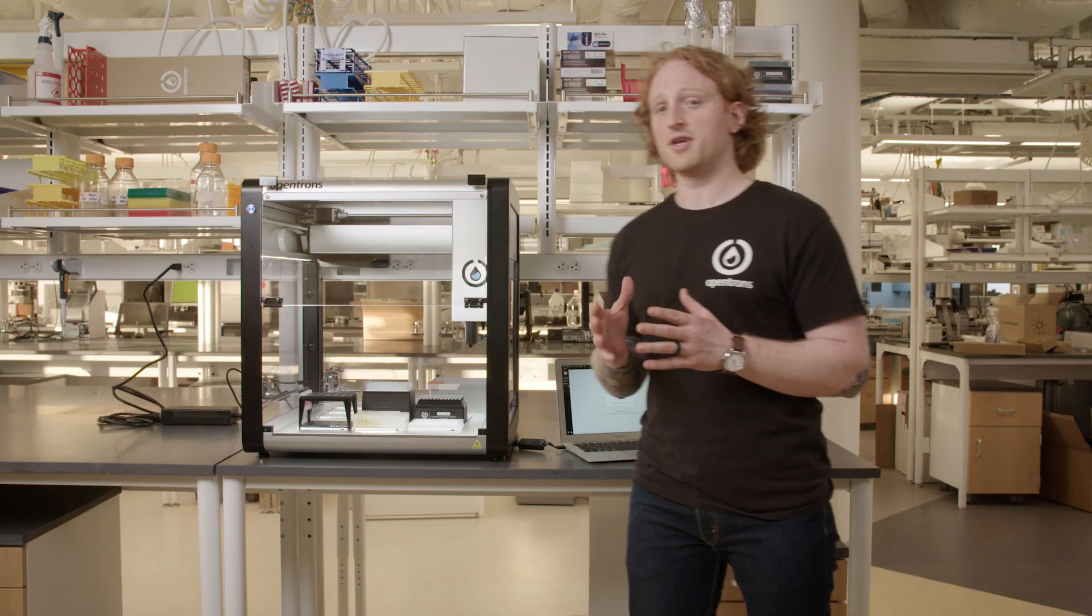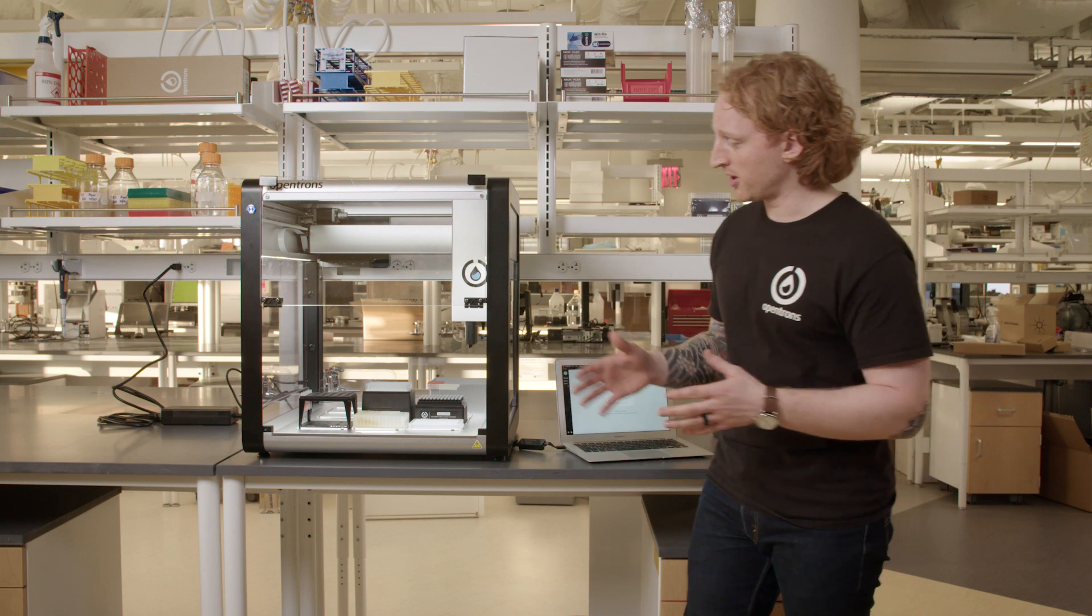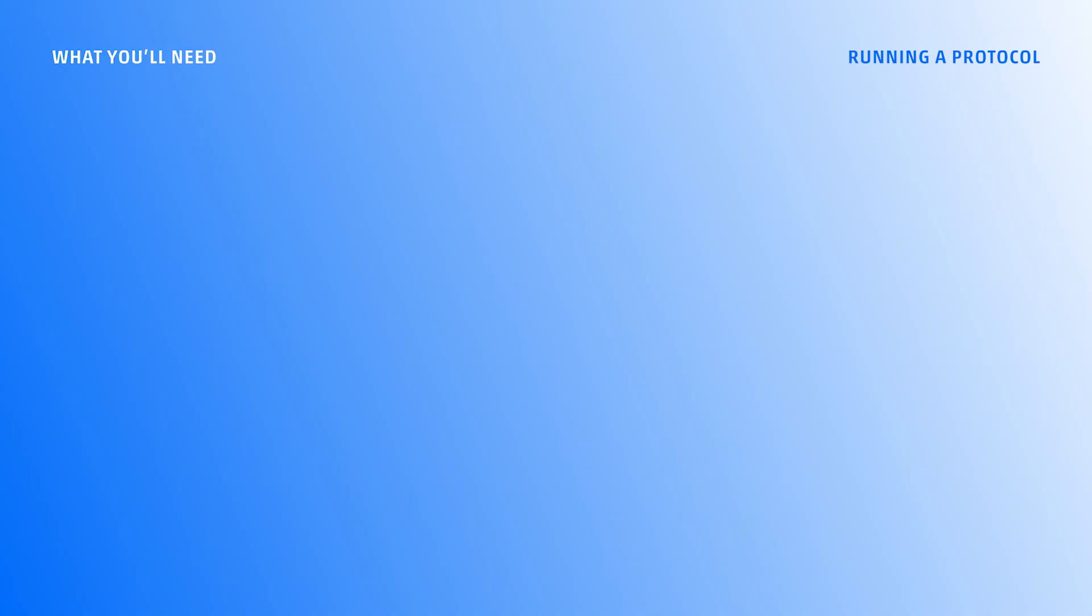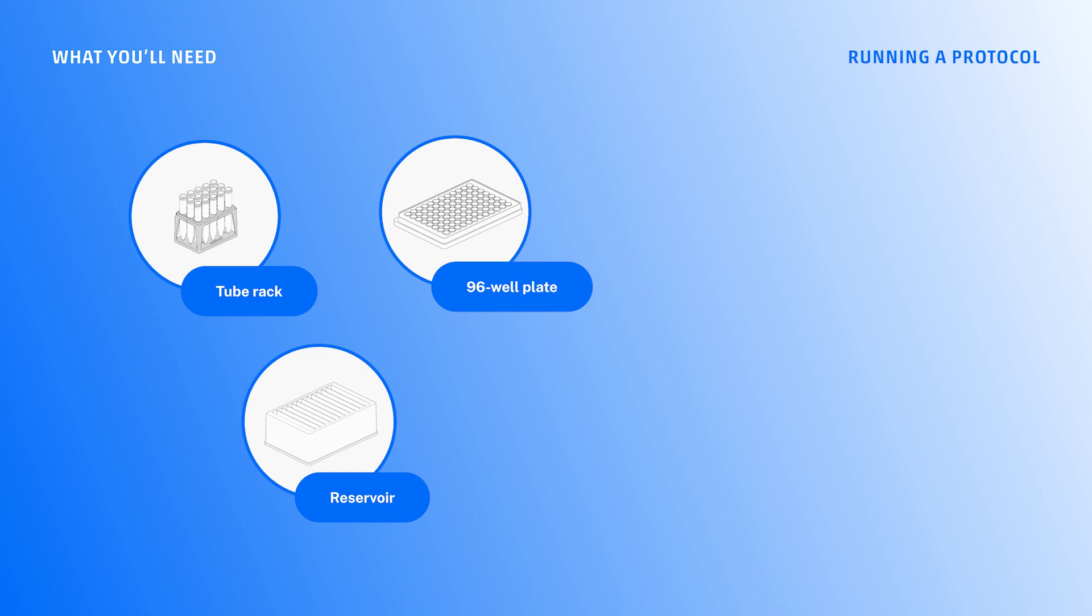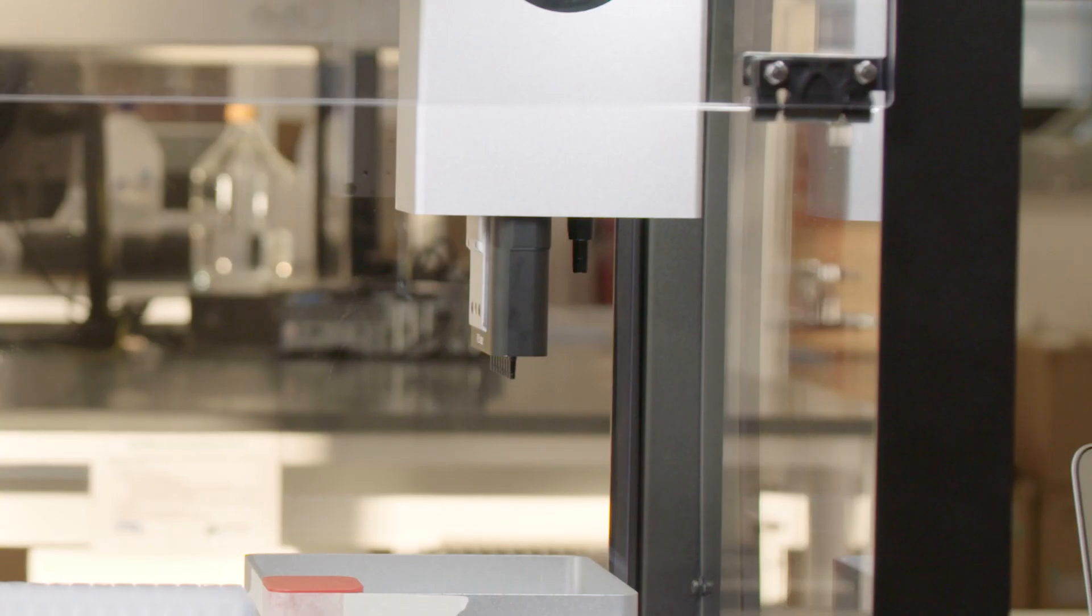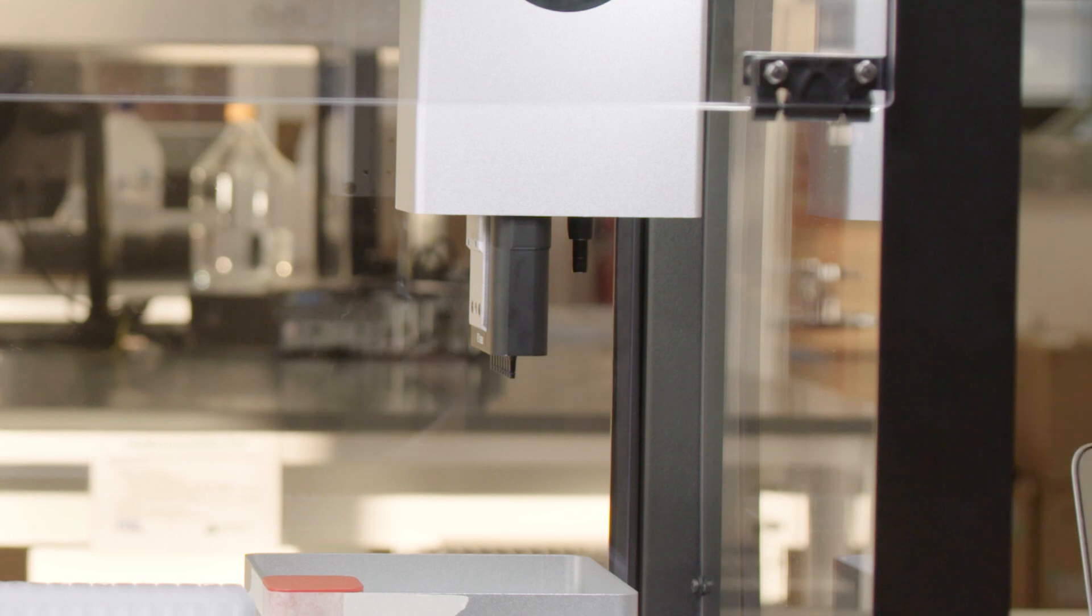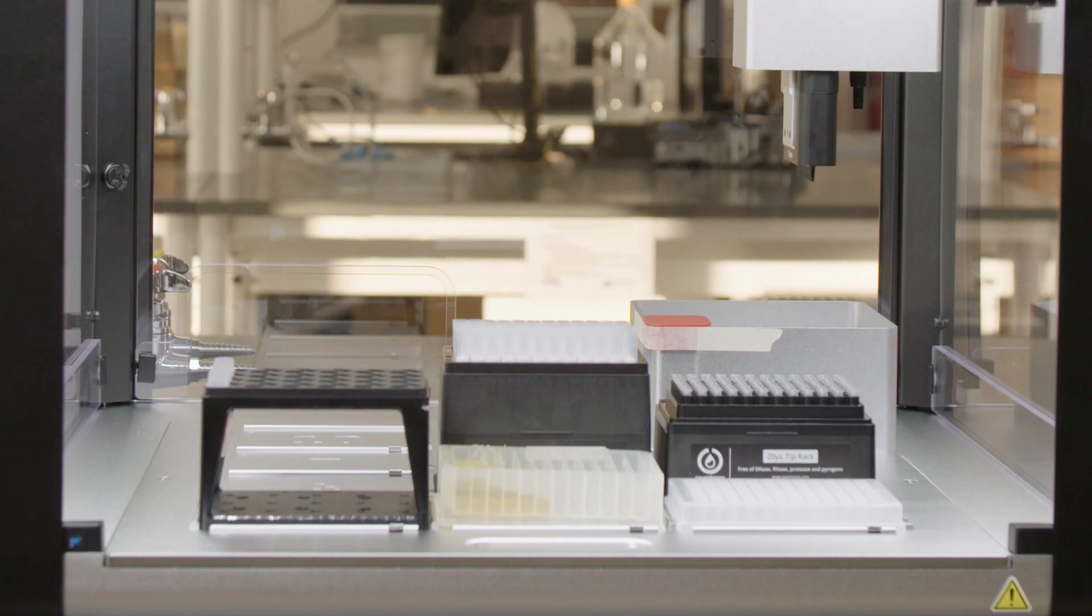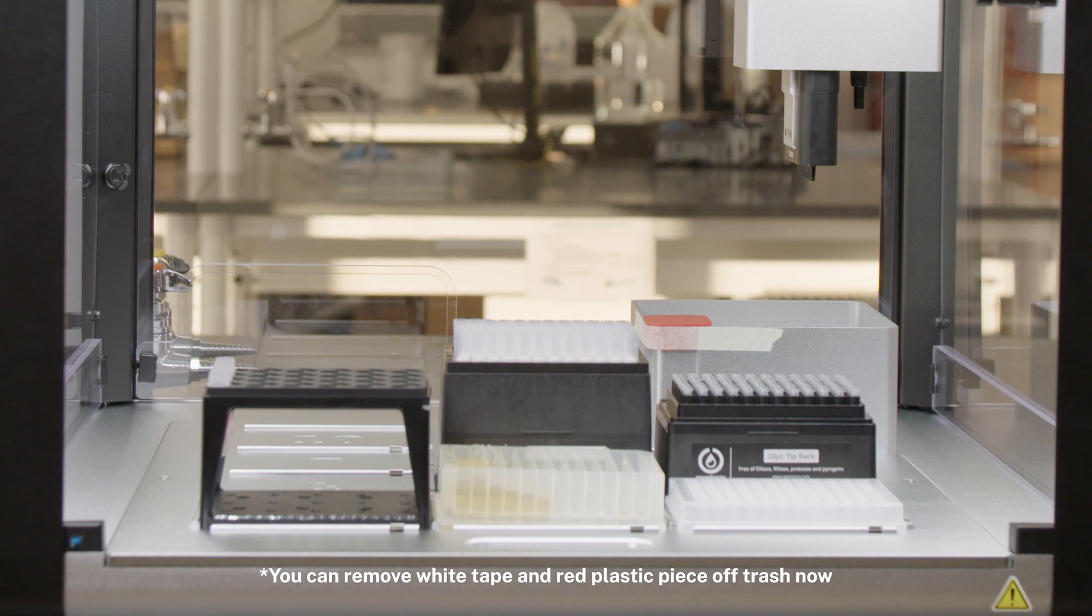For this I'll need all the labware I'm going to be using in the protocol. I have a tube rack, a reservoir, and a well plate. I'll also need the tip racks for each pipette. I have a P1000 on the right side and a P20 Multi on the left mount. Lastly, I should always put the trash in before I run any protocols.